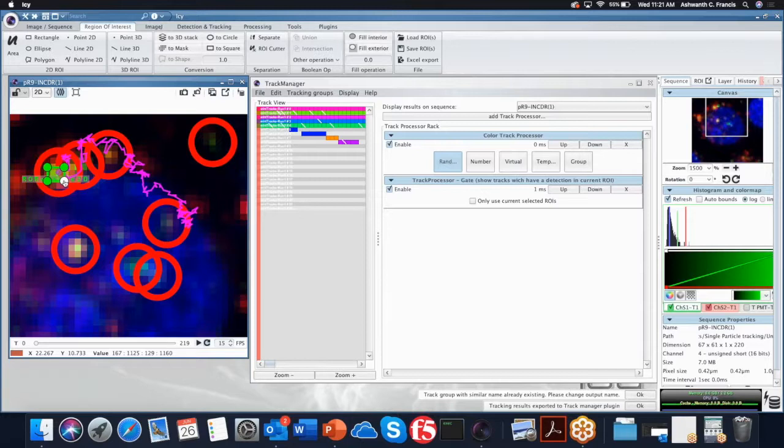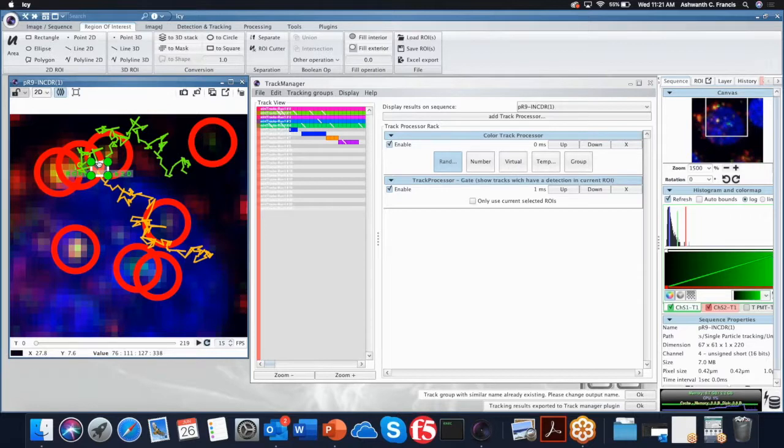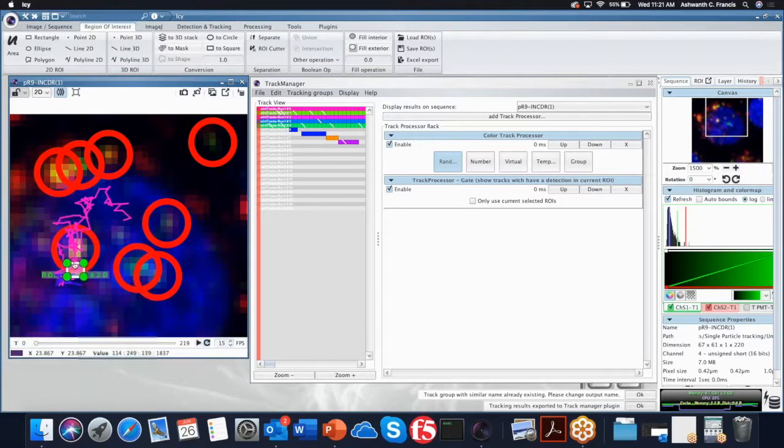Now what you can do is, once you've drawn this region of interest, some people have already come to the point where you can actually move this around, okay, and see the tracks of different particles. All right. So let's say I would like to see the information of this particle along. Okay. So just for example, I'm saying. So you go to a track that you like, and you stay on that track.